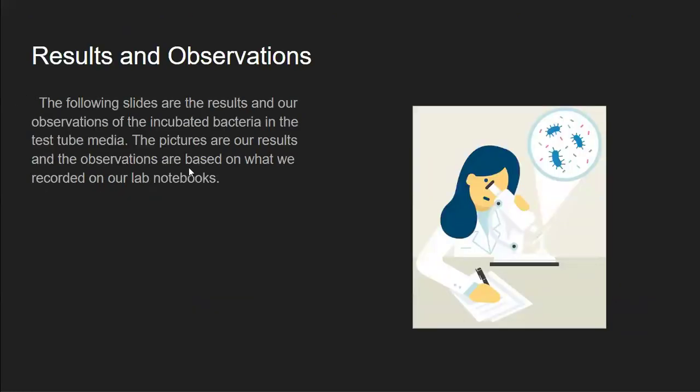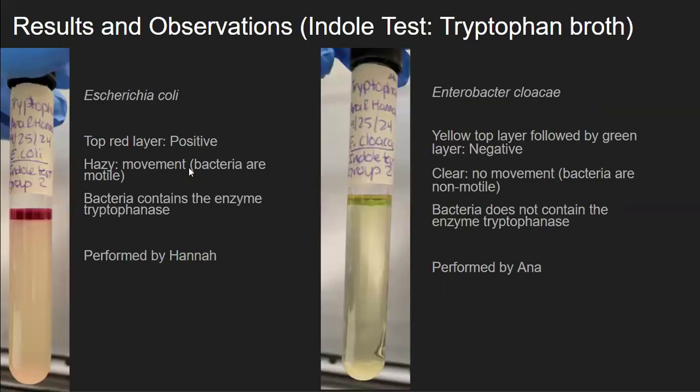The results and observations. The following slides are the results and our observations of the incubated bacteria in the test tube media. The pictures are our results and the observations are based on what we recorded in our lab notebooks. Results and observations, indole test, tryptophan broth.